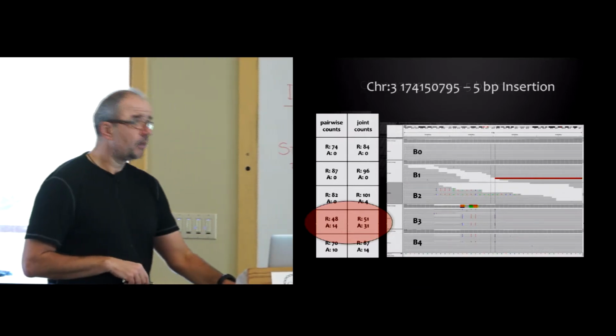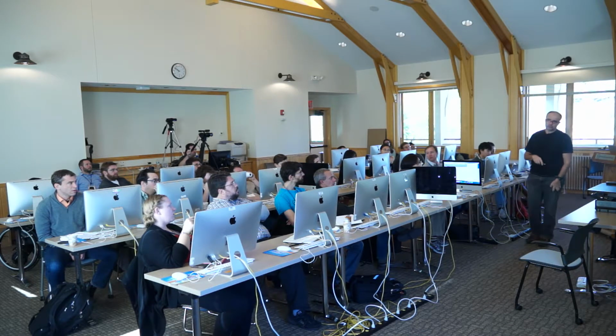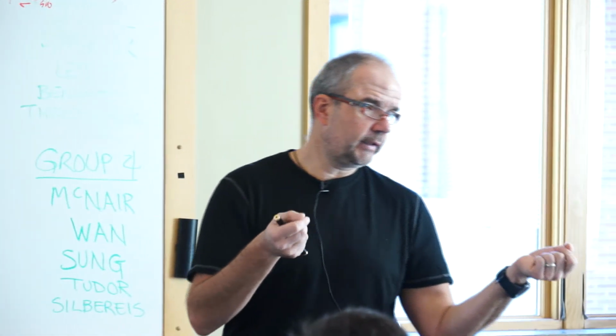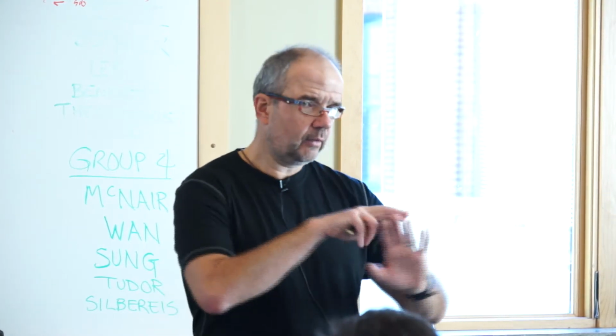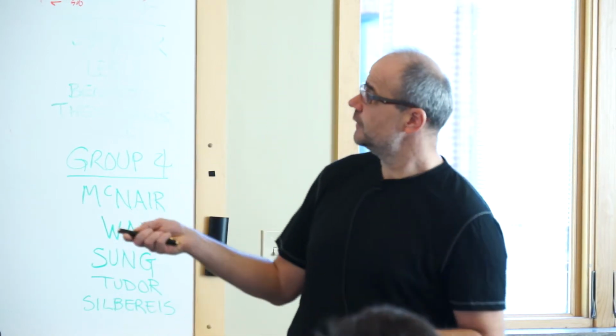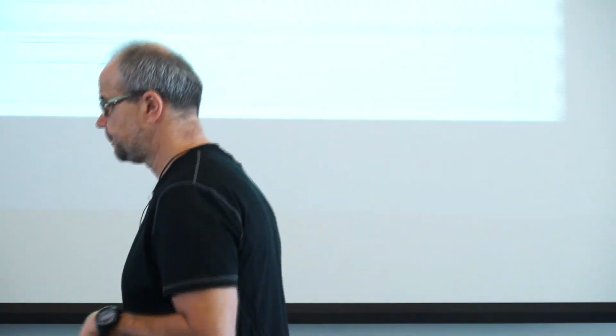How is it that your reference allele counts are also increasing? Well, that's an interesting one. That's because the original mapper used a specific way of aligning a particular read, and we used a different one for the remapping, one that is a little more straightforward and works in a directed manner. Yes, that's an interesting observation that we were surprised to see, but we are increasing the reference counts in some situations as well.